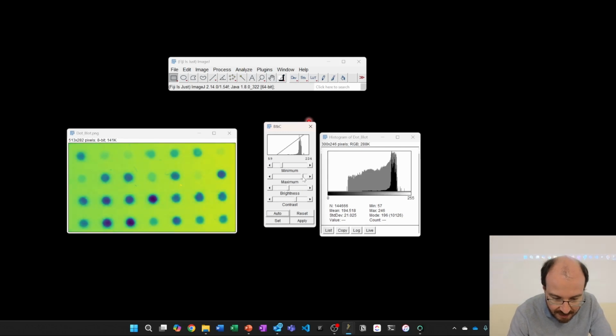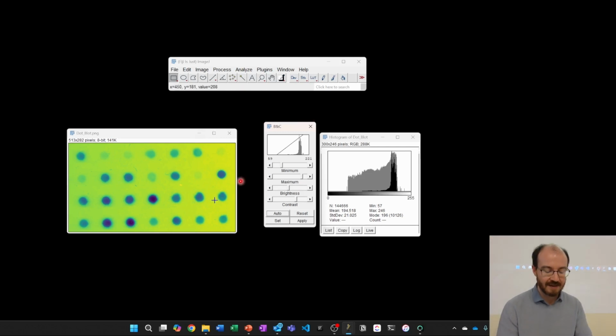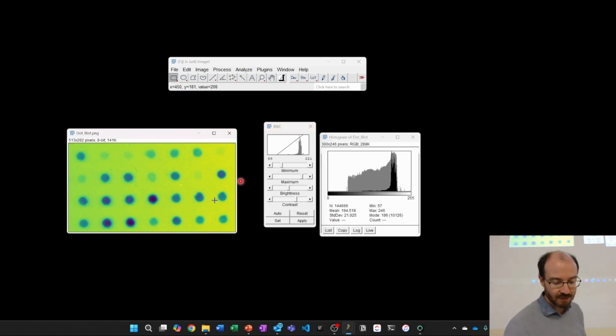I can drag this down to 220, and I can see where it is at that value at the top there. And now I suddenly have a lot more visual perception dynamic range in my visualization. I haven't changed anything in my data. It's still the exact same data. It's just visually, in my perception, that I now have much more variation between all the different structures.